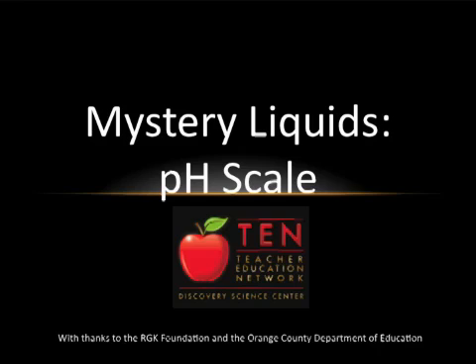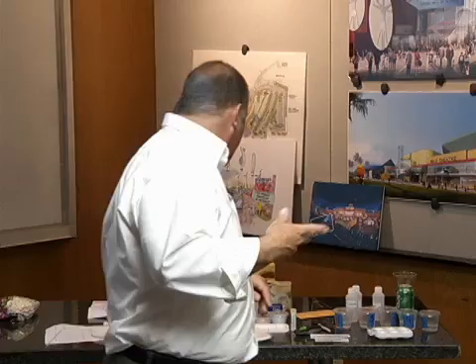So we're going to do one last experiment, and that is we're now going to look at a chemical property called pH, okay? Or talk about if something is acidic or something is basic, okay? Or something's neutral, right in the middle. Now, when you talk to the students, most of the students know about acids.